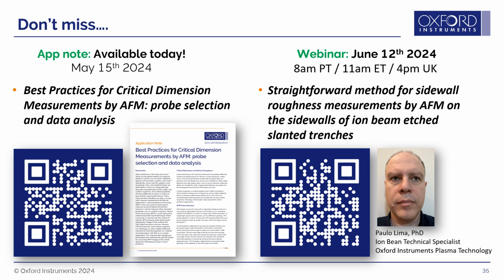Okay, so there's another question. How do you obtain sidewall roughness? Thinking of sidewall roughness, you can see that there is a geometry constraint. It's not easy to do that with AFM, where we're usually imaging from the top. We'll talk more about how we can overcome this difficulty in our next webinar. So I won't talk about it right now, but tune in and we'll talk more about that.